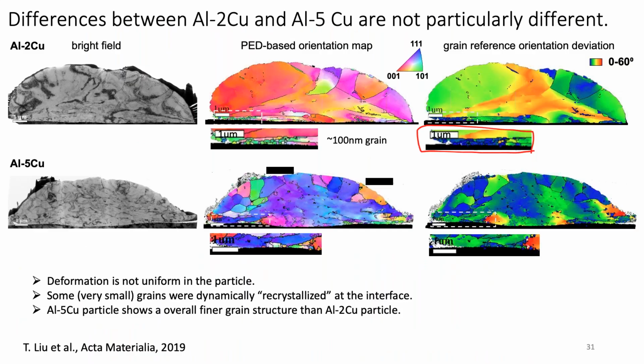Right. So when we analyze this interface here, this is pretty interesting, at the very nanometer scale, so we're talking about less than 5 nanometers, depending on what the participants are in this impact event, in the literature and in our own results, we've seen both intimate crystalline contact, but we've also seen about a 2 to 5 nanometer amorphization layer. And that amorphization layer can be a mixture of the metals themselves, but also carbon and oxygen. Perhaps some of that came about as a part of the TEM sample prep process. One would have to be mindful about that, but I have not seen oxidation from cold spray.